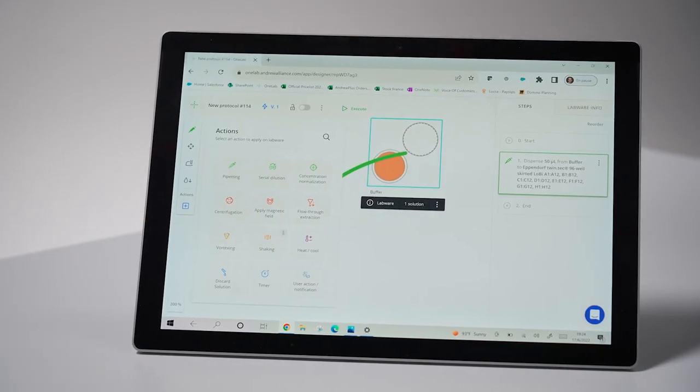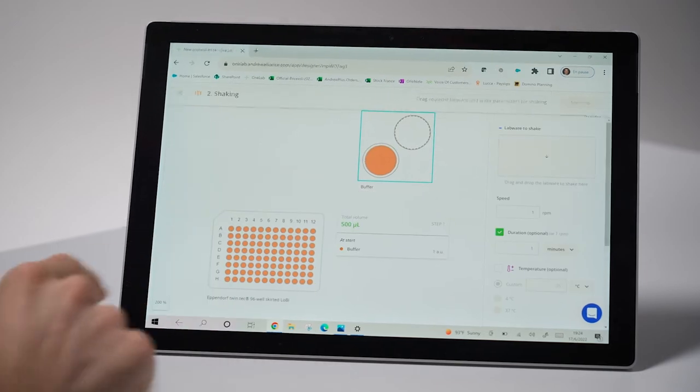This combination of software and hardware working seamlessly together not only speeds up method development to easily achieve a hands-off workflow, but also helps to provide consistency and reduce any variation between runs. Heater Shaker Plus is notably a great companion for protein digestions and bead-based extractions.